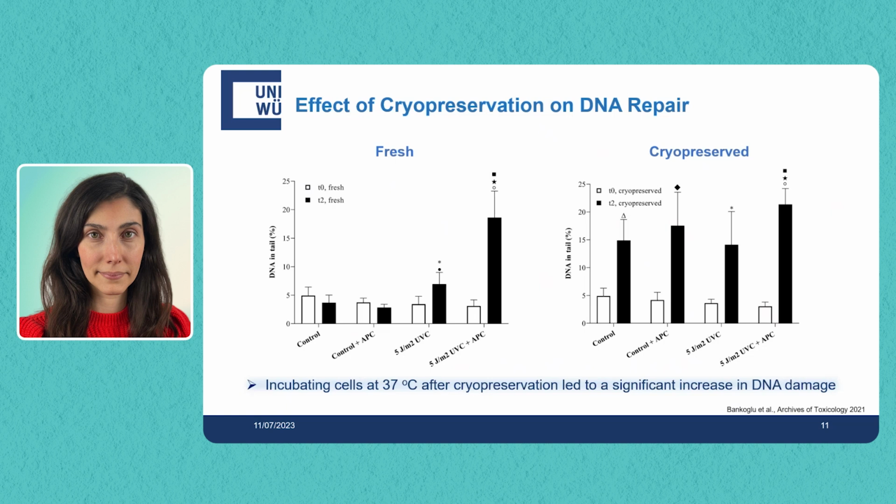At that time, we wanted to use the cells in culture, like intact cells, not preparing the protein lysate, as Sabine explained. However, using an alternative method with aphidicolin, a DNA repair activity assay. So what we have here, we have the blood cells. We have here only PBMCs because we wanted to culture them. So after isolating, we have a substance treatment, that's why we also chose the PBMCs.